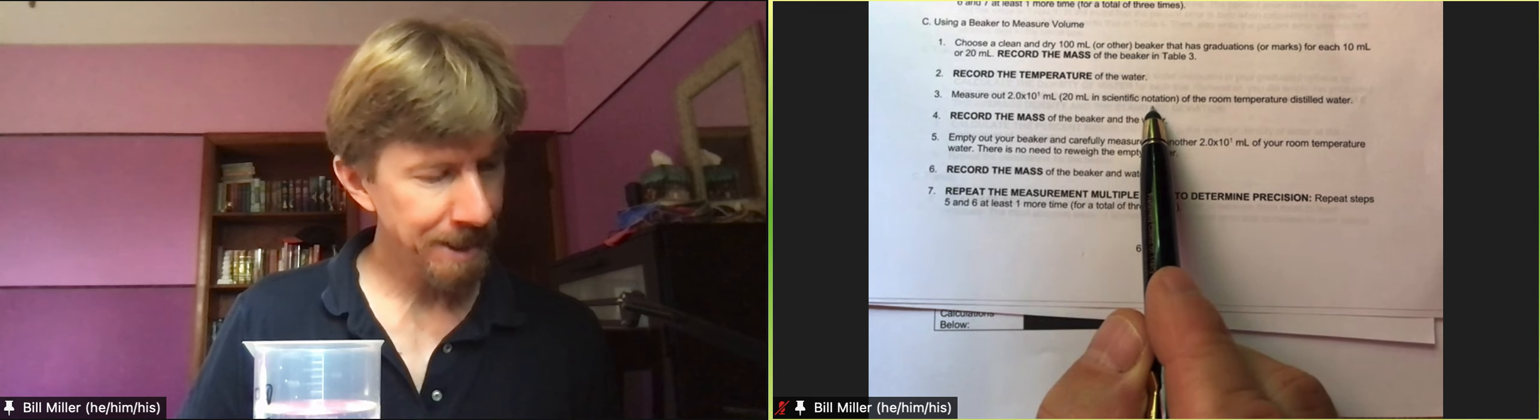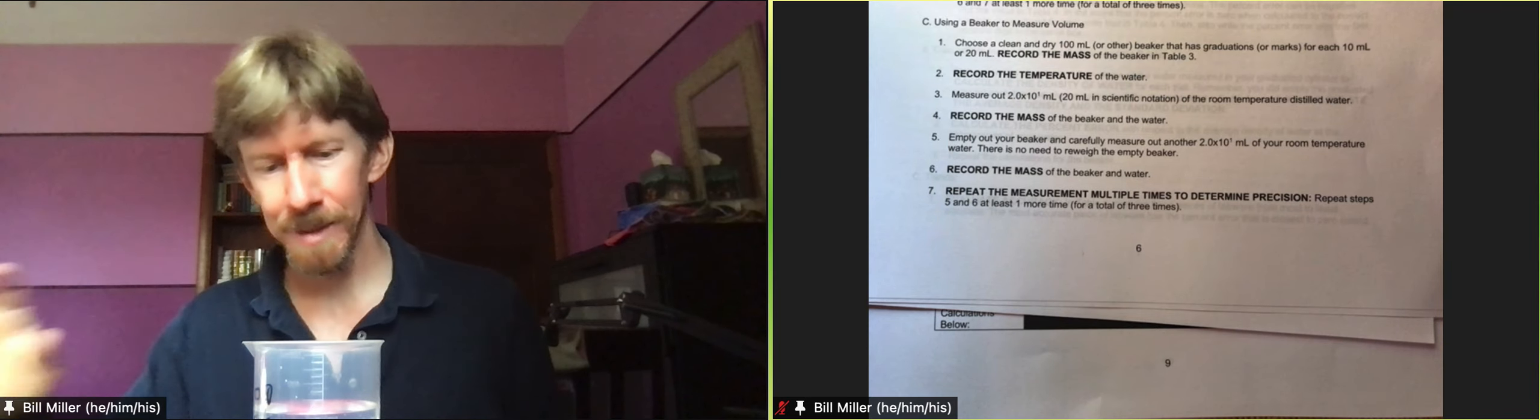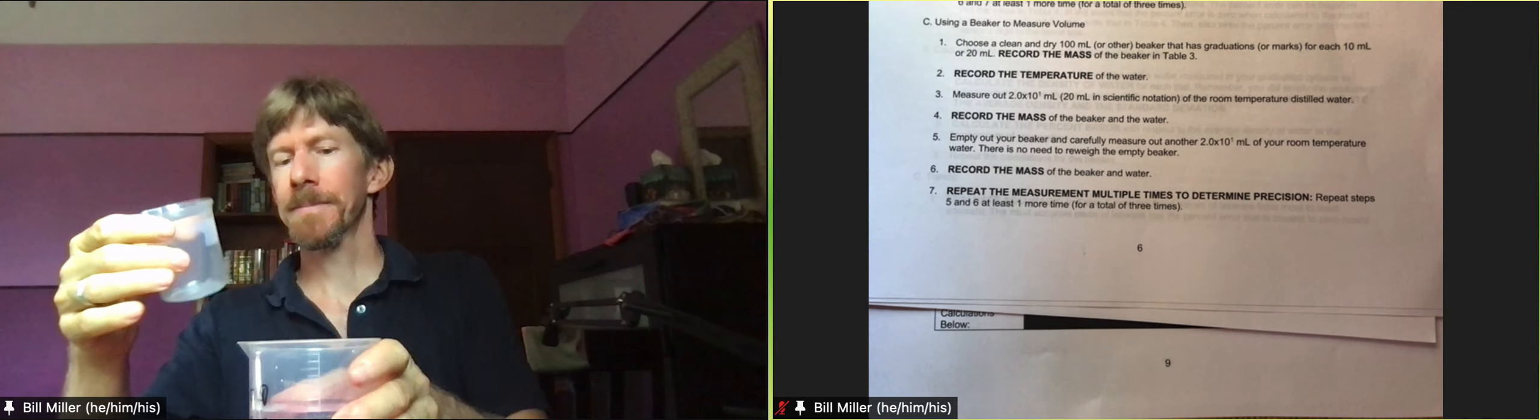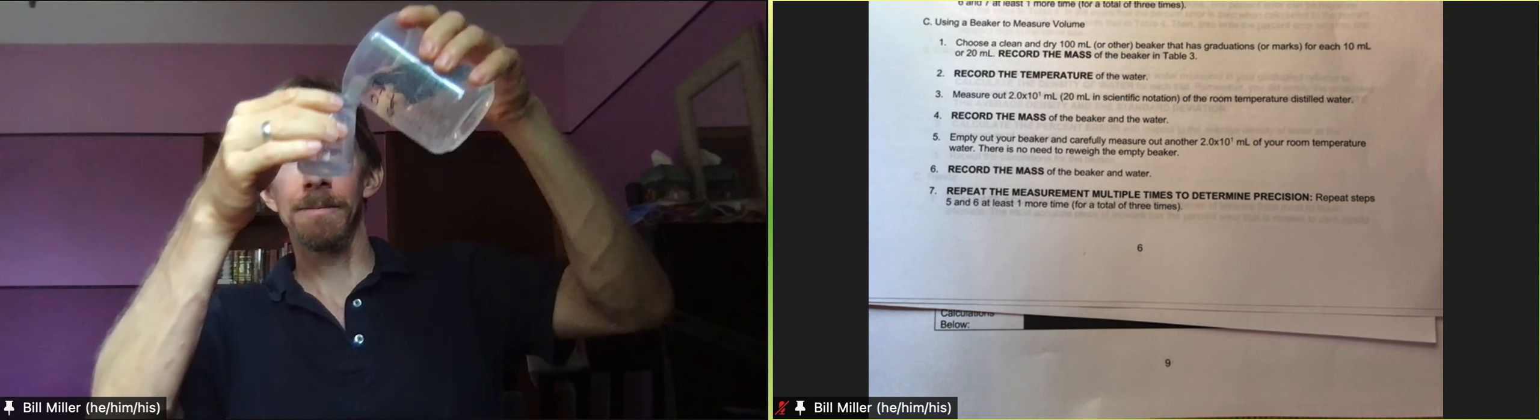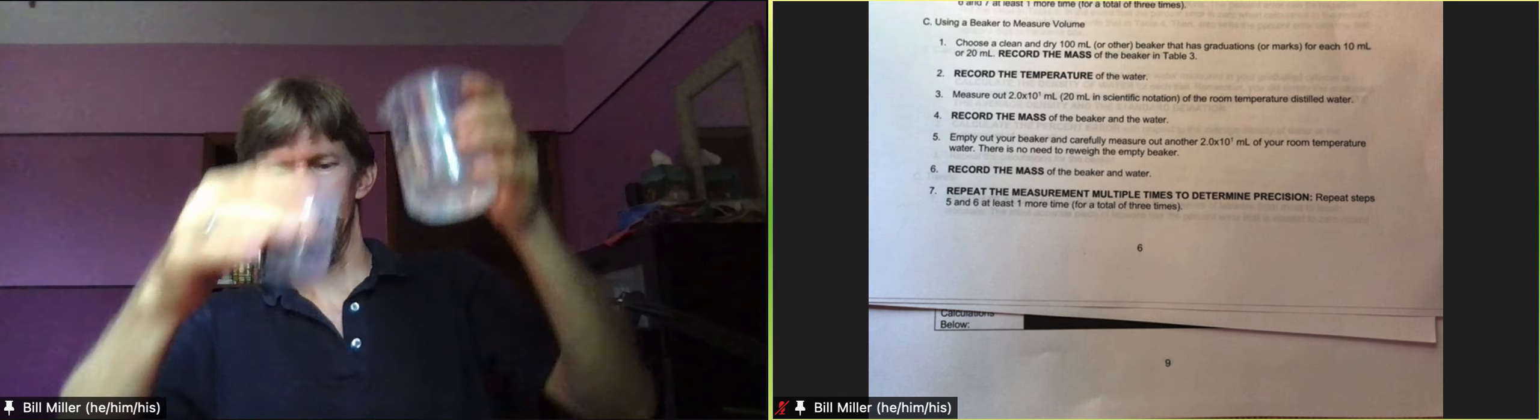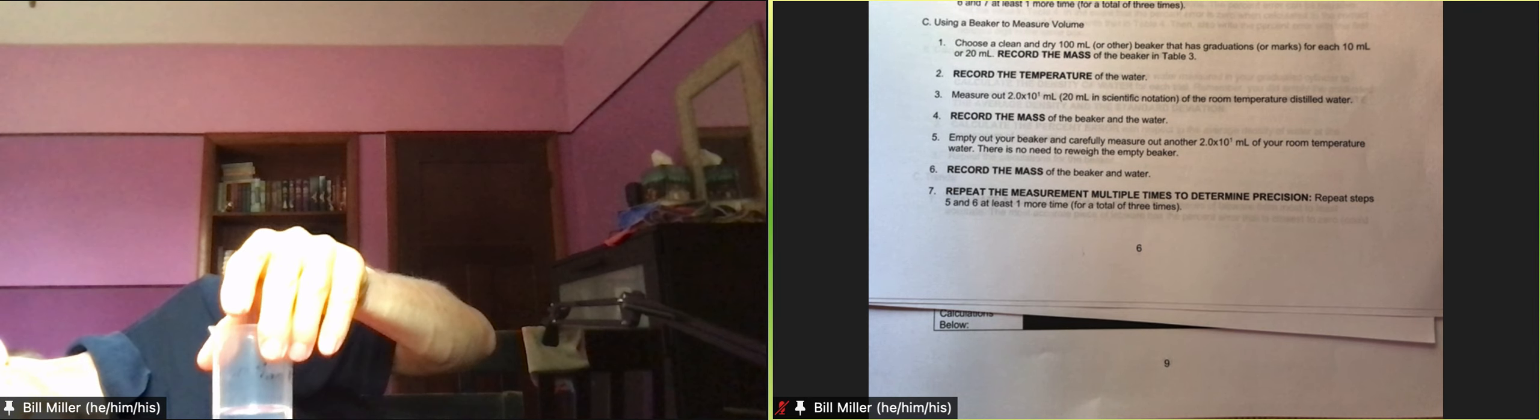And I've written it in scientific notation so that you know it has two significant figures. It's really 20 milliliters in scientific notation of the room temperature distilled, or in my case, tap water. So I've got it right here. I've got my beaker. I'm going to pour in 20. I'm going to look straight across while I do it. And I'm going to double check by looking down here on the side. When I hold it up, I can't really see that flatly.